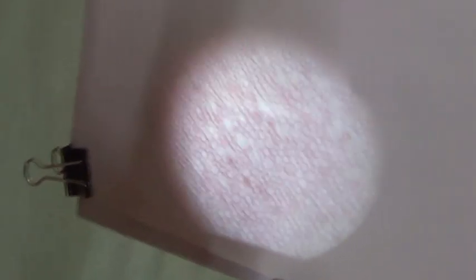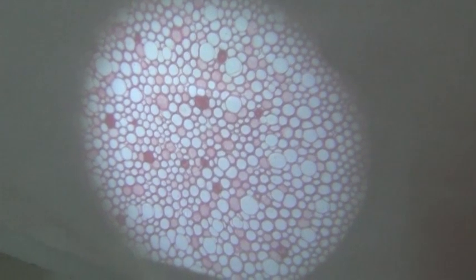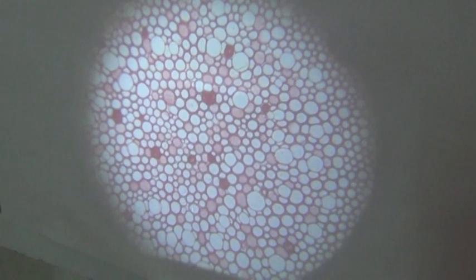This slide is projecting by this projector part. Therefore, a group of observers can view the projecting image of the specimen at a time without straining their eyes.